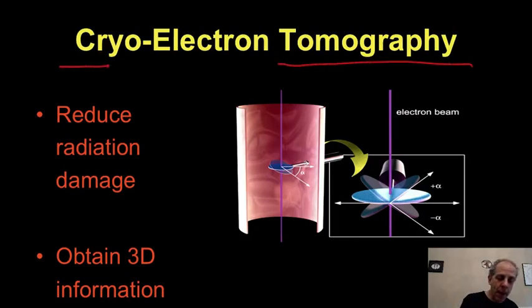Now, what do I mean by cryo? Okay, first of all, we now know what's electron. Instead of electron microscopy, we say electron tomography because we have multiple projections. Cryo is because with the specimen, before we put it here, we freeze it at cryo temperatures.